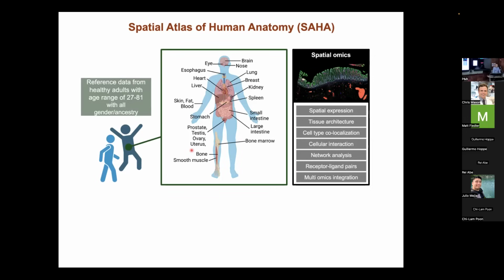I didn't know if it was expression heterogeneity or actually spatial. No, it's expression. It's based on expression of RNAs and proteins within those cells themselves. That's how we're defining heterogeneity. Okay. And every once in a while you'll find a stray cell that makes you wonder what the hell it's doing there, because it's kind of an outlier. But that might also be related to the processing of the tissues or things like this.